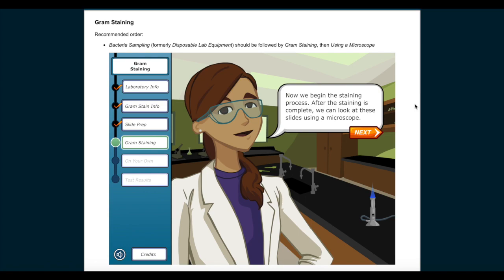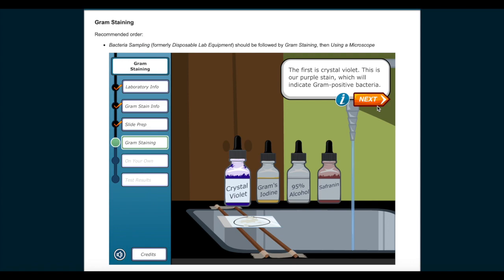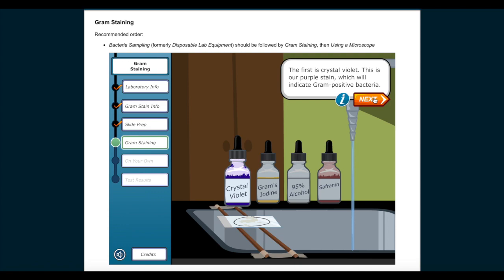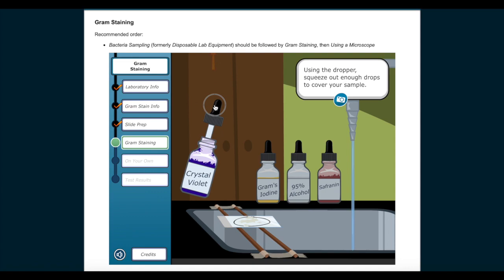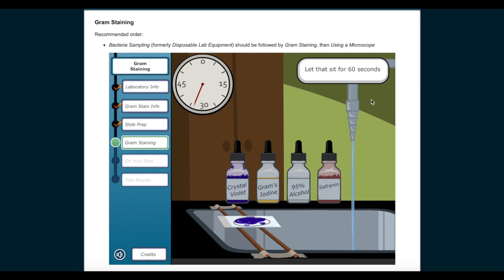Now we begin the staining process. After the staining is complete, we can look at these slides using a microscope. We use four chemicals to stain a slide. We apply them in a specific order and rinse the slide off under slow running water in between each chemical. The first is crystal violet. This is our purple stain, which will indicate gram-positive bacteria. What is crystal violet? It is a violet-colored dye. The dye penetrates the cells of gram-positive as well as gram-negative microorganisms. This happens because components in the dye form positively charged ions that associate with negatively charged components in cell walls. Using the dropper, squeeze out enough drops to cover your sample. Let that sit for 60 seconds. Now rinse it under slow running water.